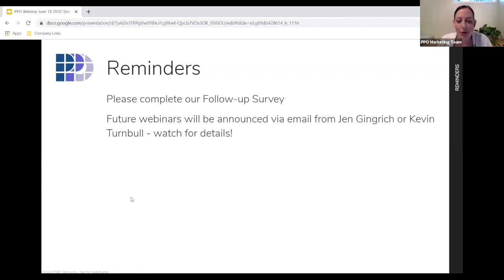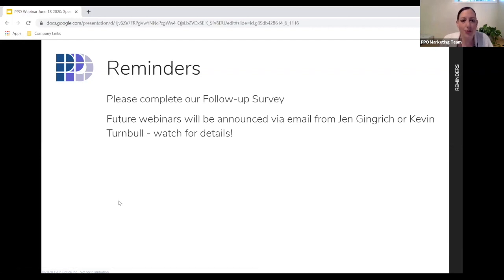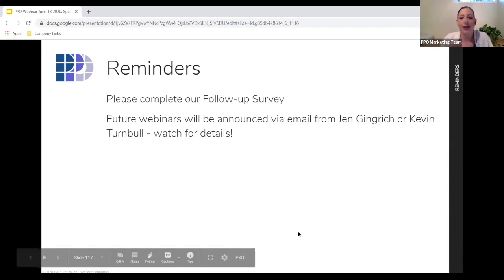So we'll give a couple more minutes for questions to come through. Priya, I'm wondering whether maybe you could jump back in for a minute. You mentioned earlier how easy it is for us to swap out the lights in the spectrometer in the field because of all the calibration work we do up front. Could you give us a little more information on how that process works and how we make sure that everything stays standard and really easy?